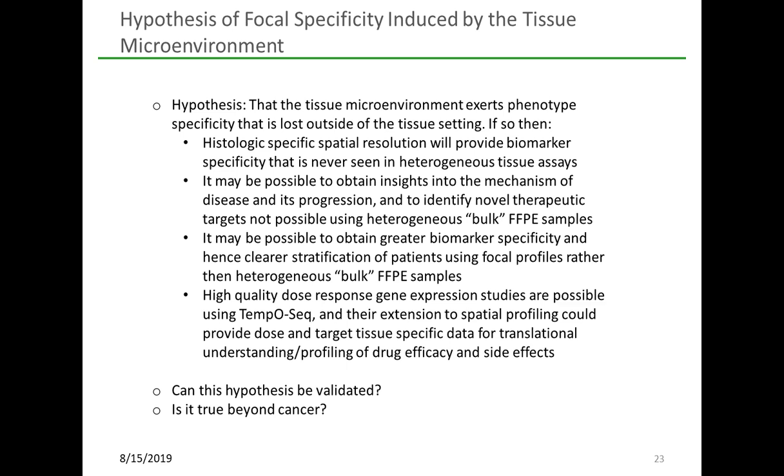So basically, those are things which we can talk about generally, but there's another aspect for Tempo-Seq, which is that more recently people have been using it to generate high-quality dose-response data.